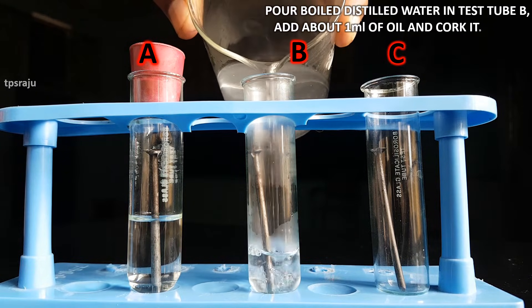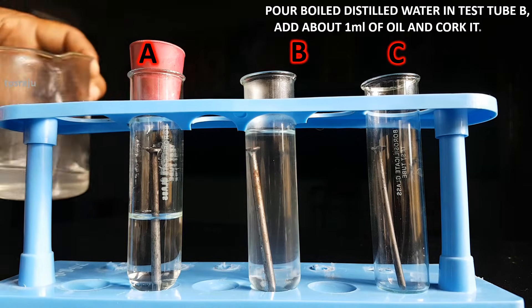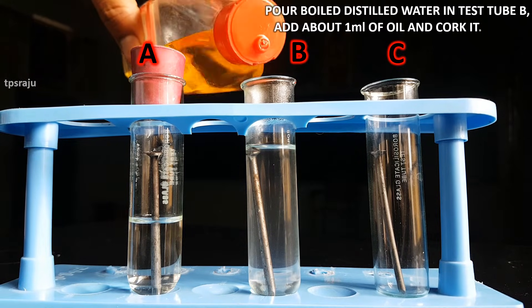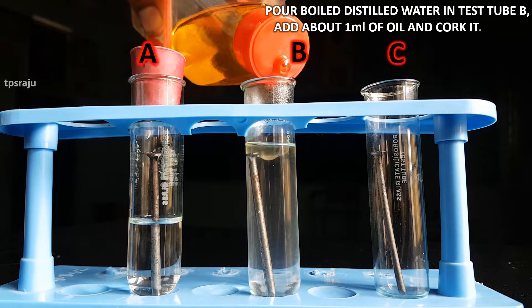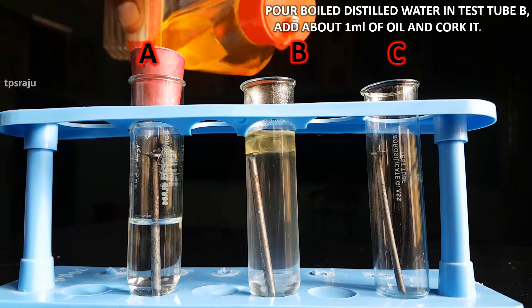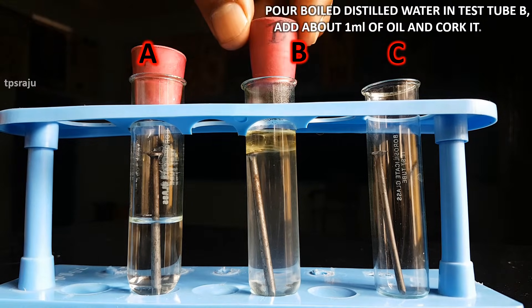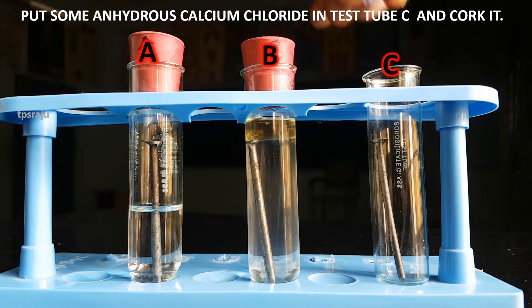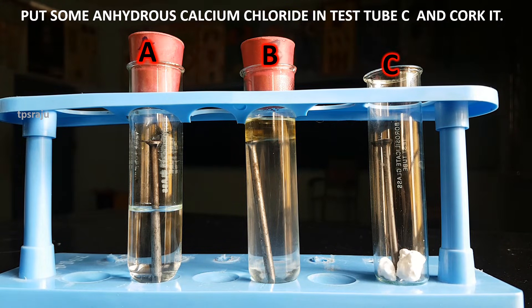Pour boiled distilled water in test tube B. Add about 1 ml of oil and cork it. Put some anhydrous calcium chloride in test tube C and cork it.